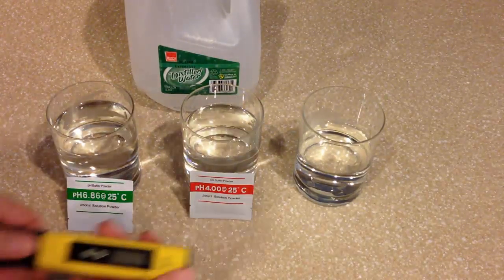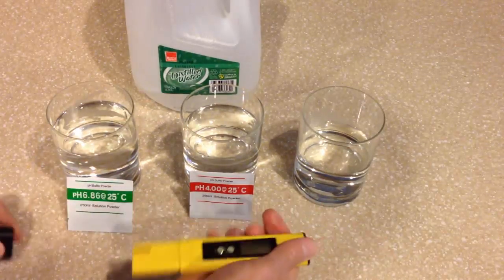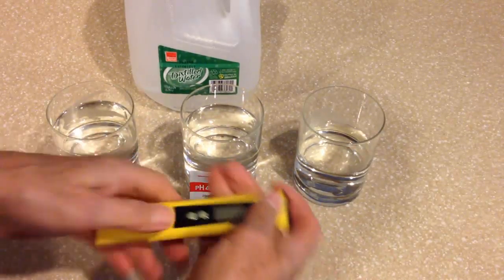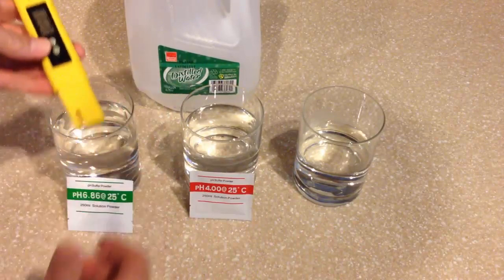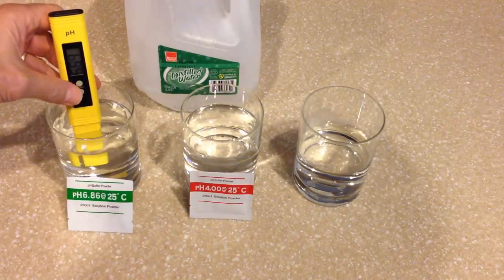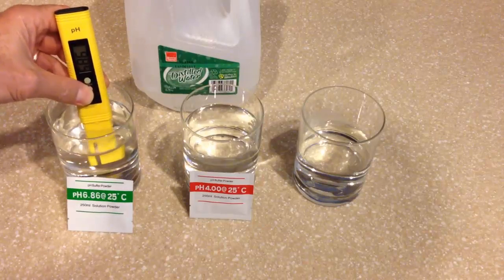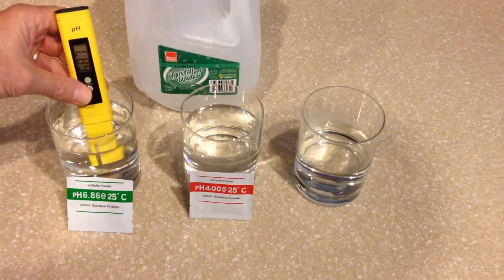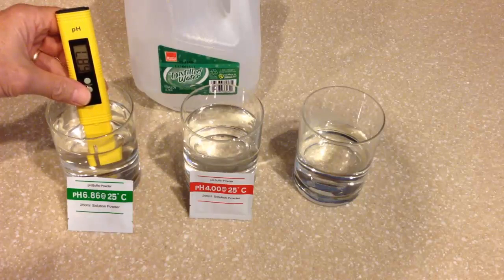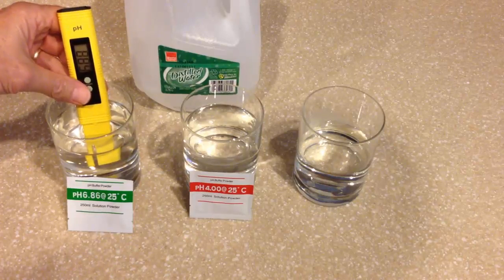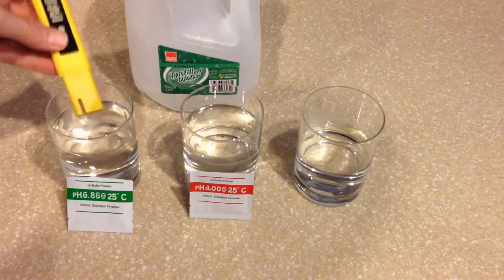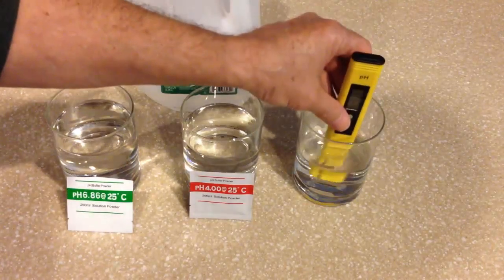So, let's demonstrate how easily this happens. We're simply going to remove the protective cap, turn it on, insert the probe into the 6.86 solution, press the calibration button, hold it for three seconds, and allow it to start to flash. It'll flash at 6.86, and once it stops flashing, there it is, it's stopped at 6.87, which is absolutely fine.